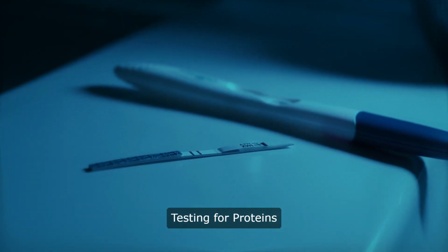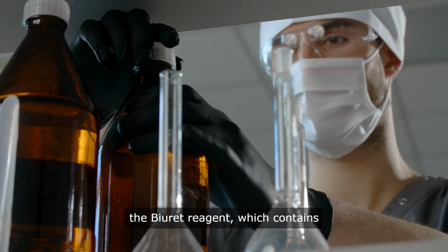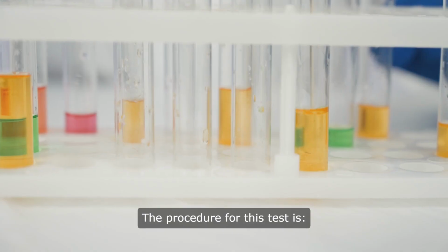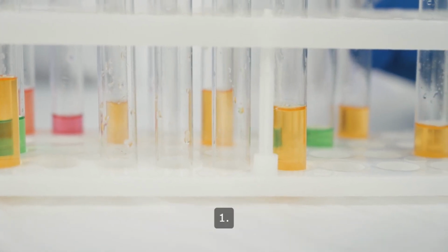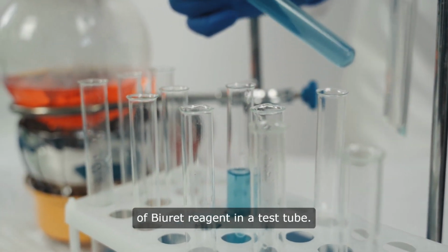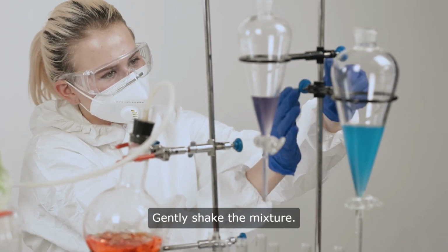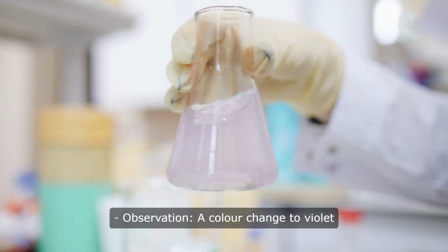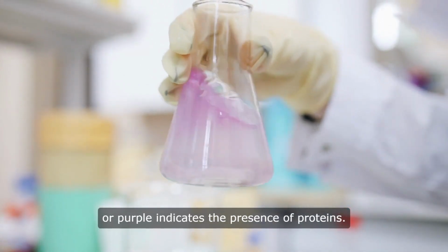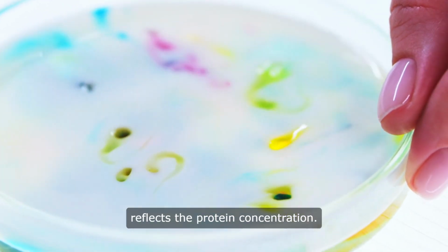Testing for proteins, Biuret test. Proteins can be identified using the Biuret reagent, which contains copper sulfate and sodium hydroxide. The procedure for this test is: 1. Mix the food sample with an equal volume of Biuret reagent in a test tube. 2. Gently shake the mixture. Observation. A color change to violet or purple indicates the presence of proteins. The intensity of the color change reflects the protein concentration.